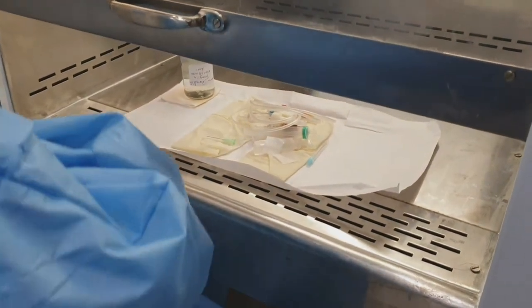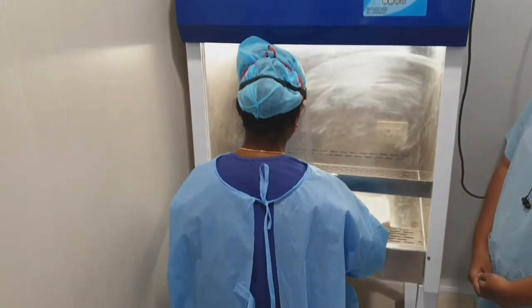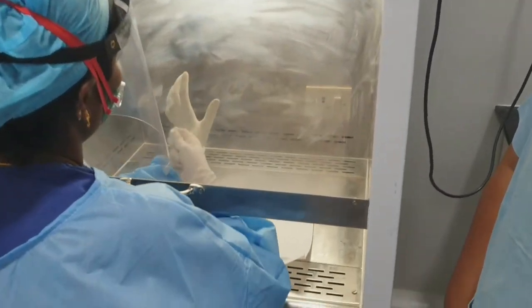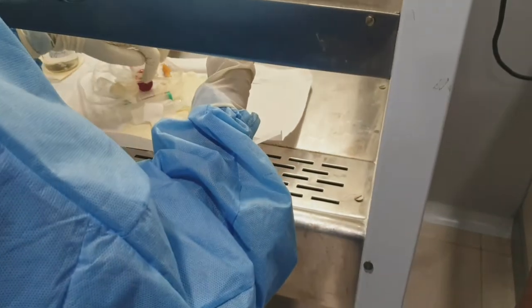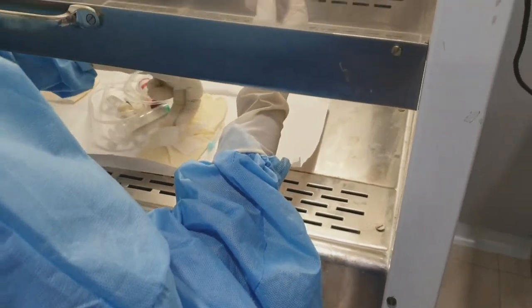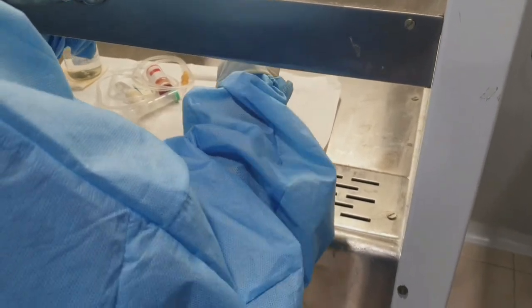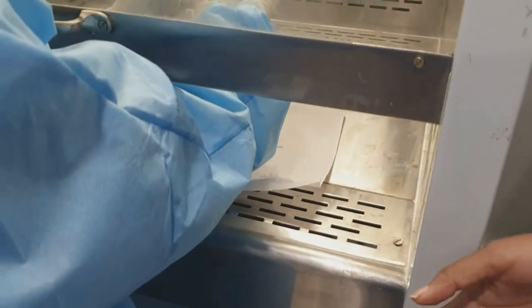The personnel is sitting near the laminar hood and she is loading the chemotherapy drug now. After entering into the laminar hood, she will be wearing the second pair of gloves. Two pairs of gloves are required because it helps prevent the chemotherapy from penetrating onto your skin, and in case there is any spillage, it helps you to not penetrate inside.